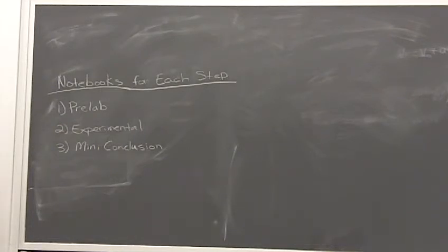Does it look like the product is in there? What does the IR spectrum look like? It's just the very basic results. Do they look good, and can you go on to the next step? Okay, so that's what you're putting in that mini conclusion. So discussion on mass, discussion of NMR, discussion of IR, can you move on to the next step, all right?